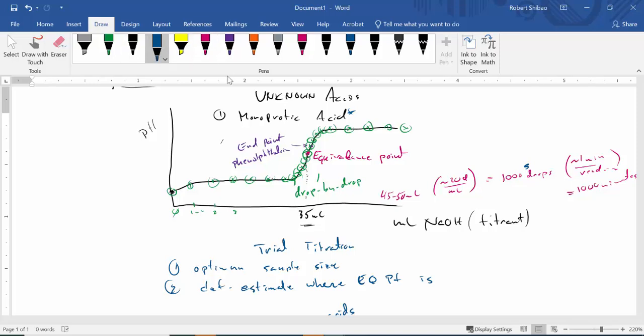Half of 35 is 17 and a half. So around 17 and a half, we're going to start collecting extra data to see if we get a little wave here. You might not. It might stay flat, or you might have a little bump, but we're looking for a little bump here. Before you hit 17 and a half, not at 17 and a half, because 17 and a half is the middle of the wave, we need to catch the wave at the beginning and at the end.